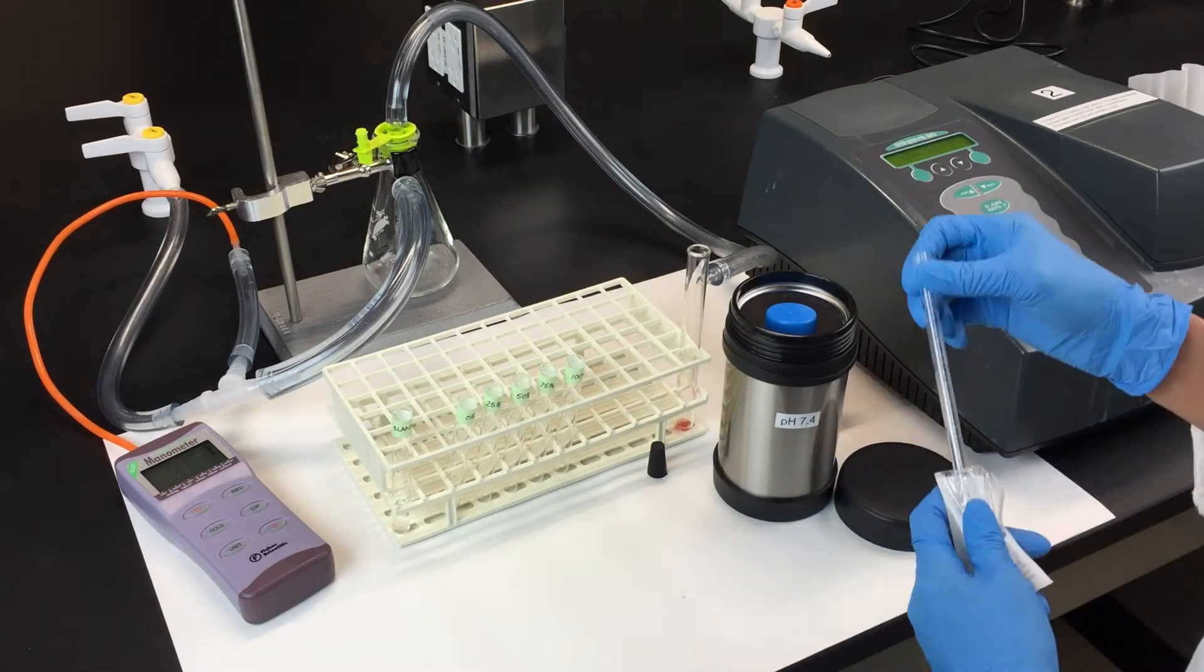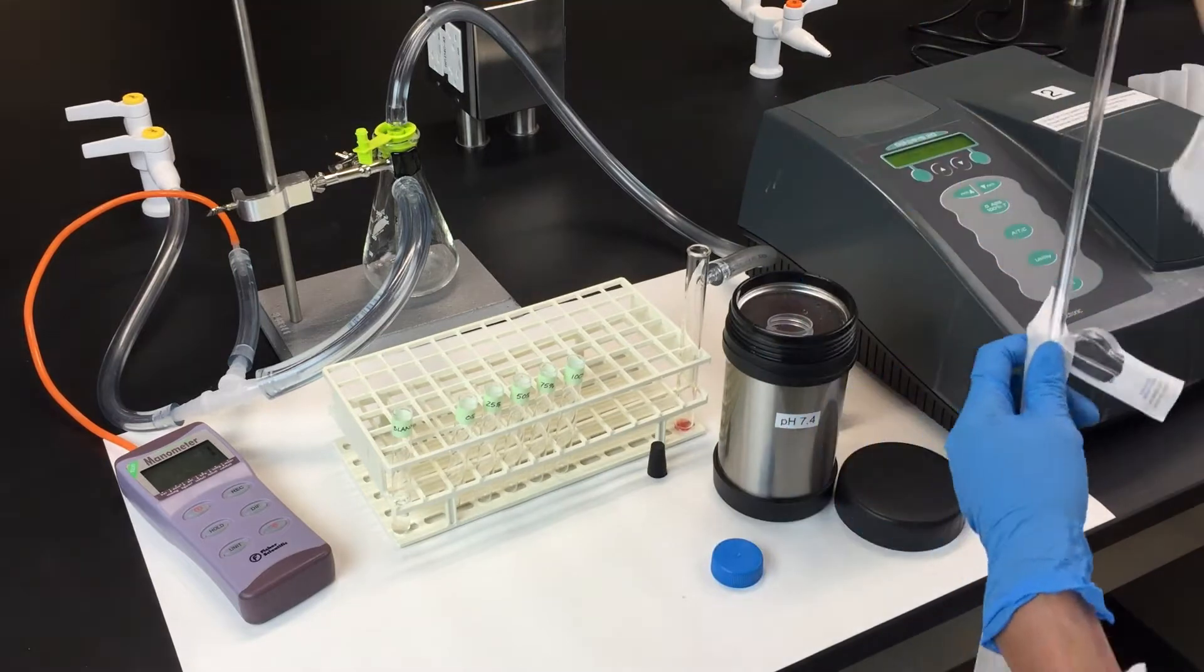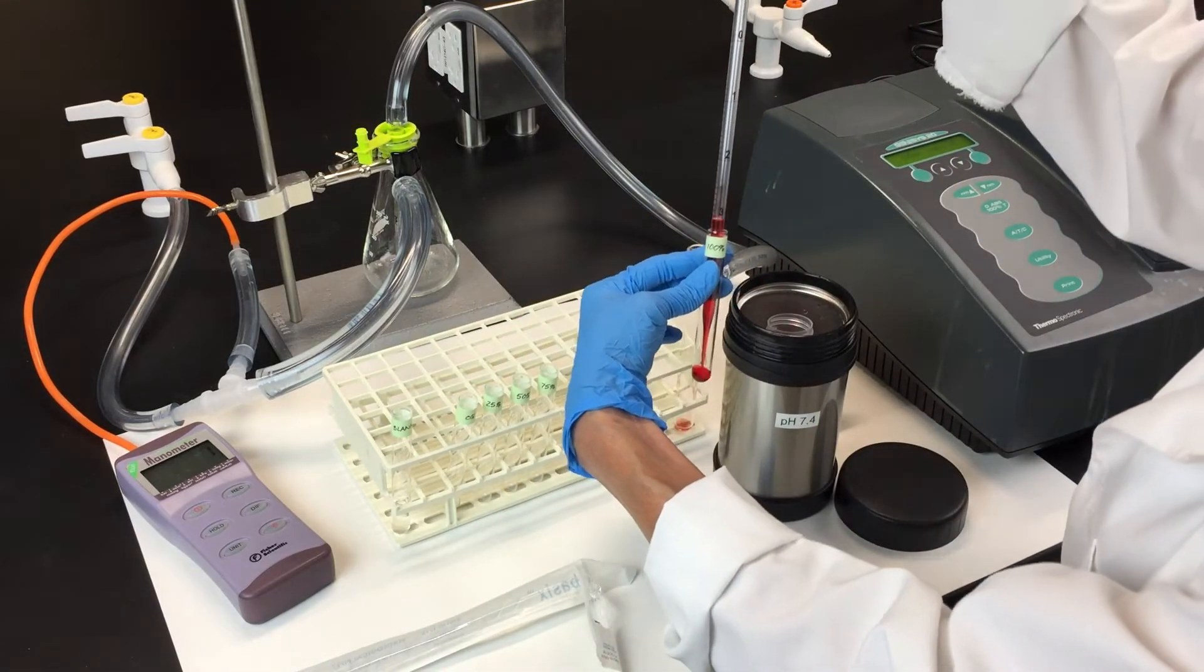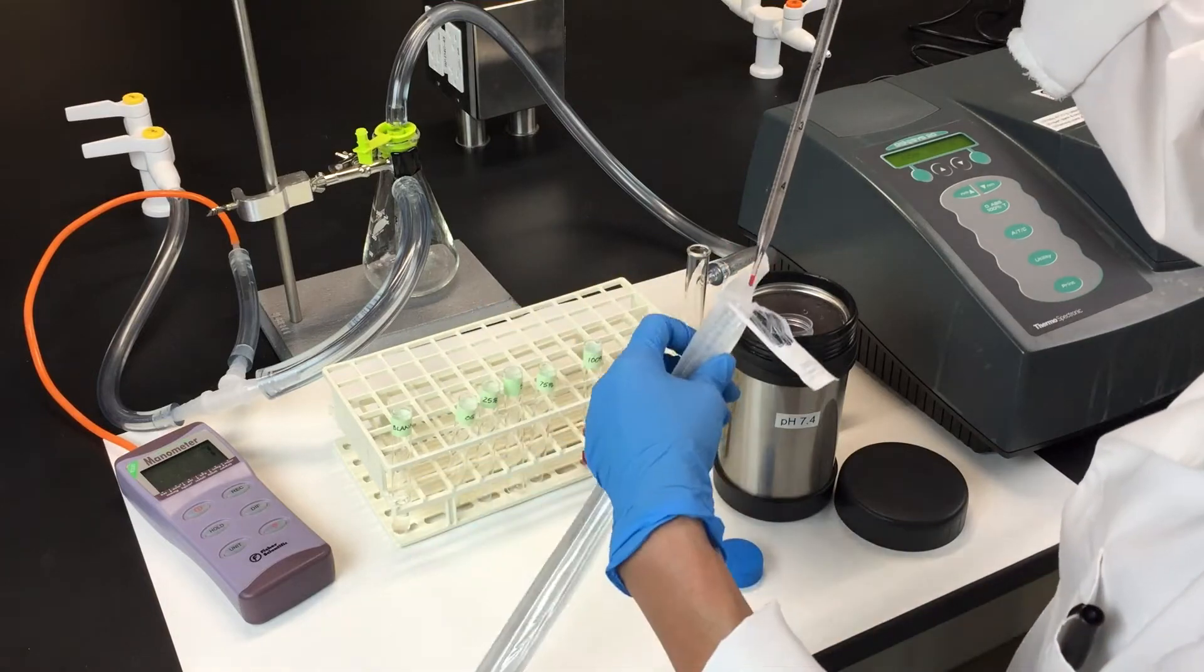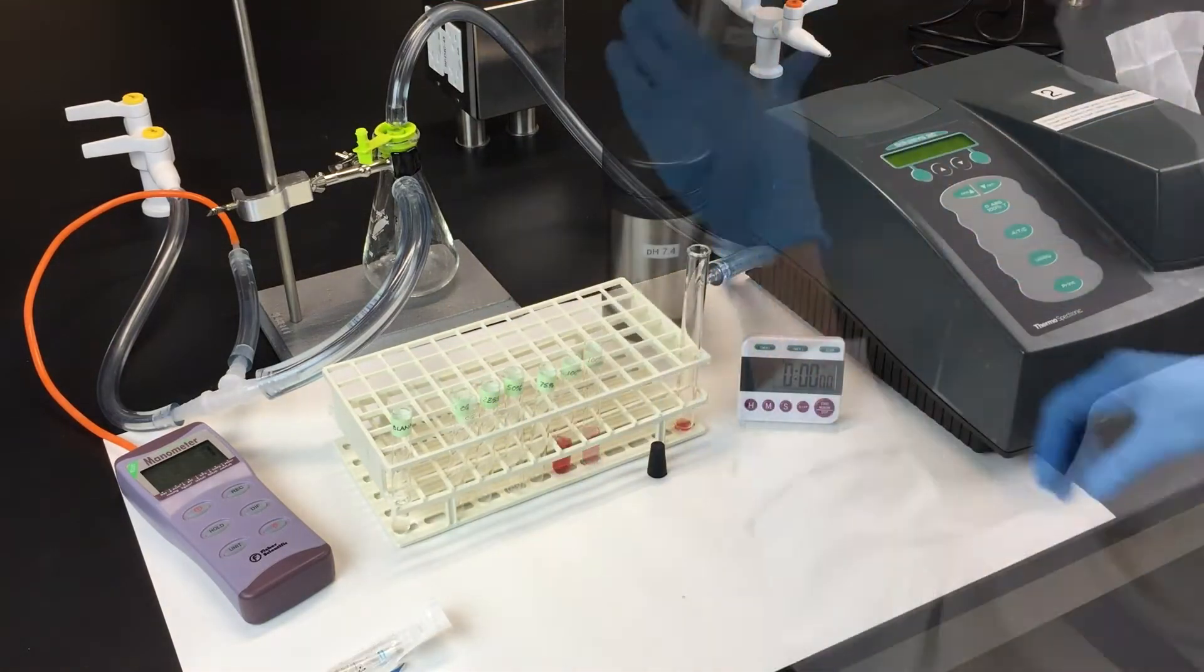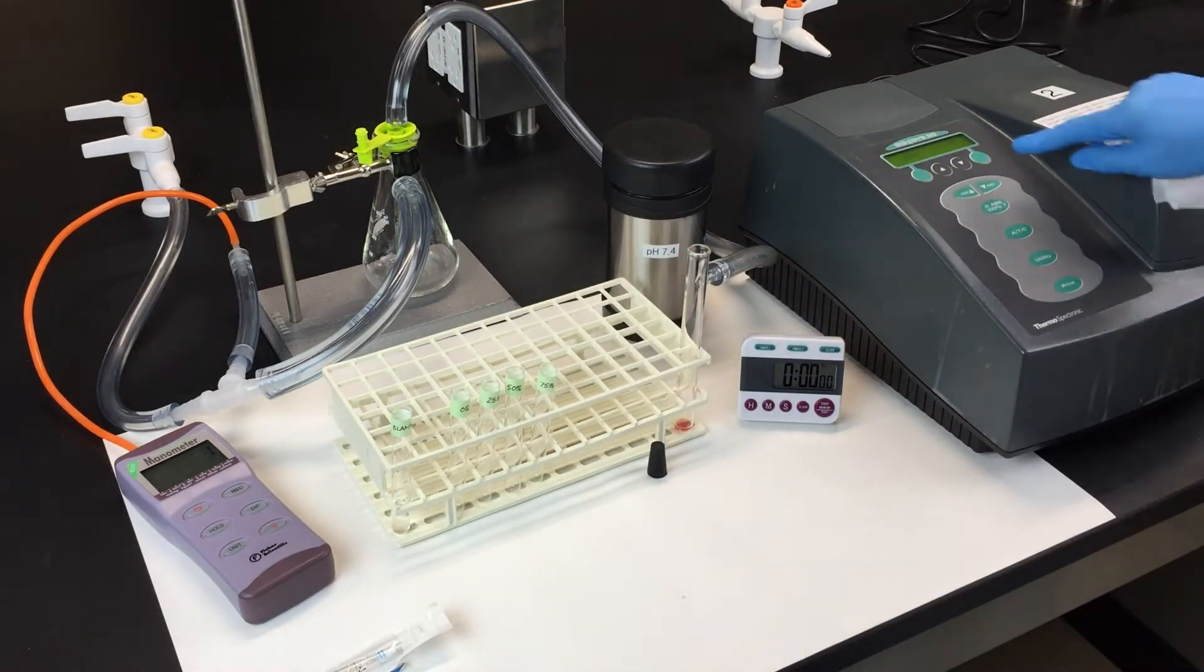Begin by transferring 2 milliliters of your hemolysate to the 100% tube and let it warm up. Once it's warmed up, wipe off the tube, place it in the spectrophotometer, and take your reading.